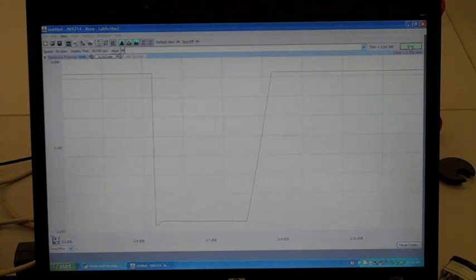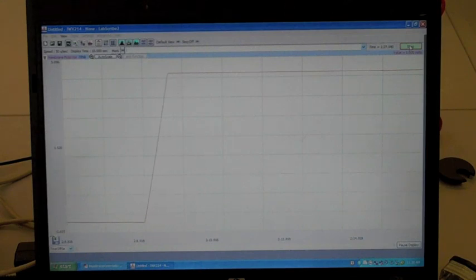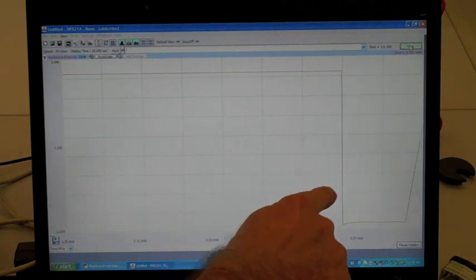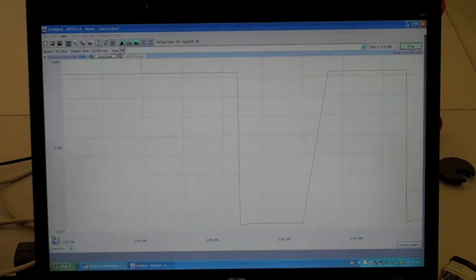in several places. Each time you do that, you will need to record. As these events are proceeding, you will notice there is a time scale along the bottom of the graph, these numbers. And when you press that electrode into the tissue, your partner who is working with you will at that moment record that time. So in this case it's 236, 237. Record that time of that event, because you're going to have to go back later and collect that data or transfer it to your data sheet.